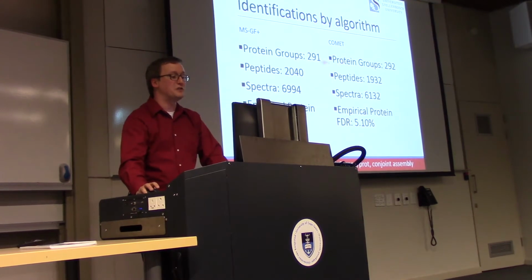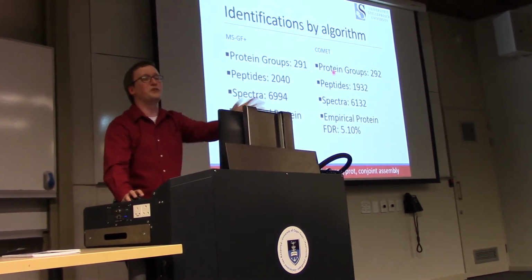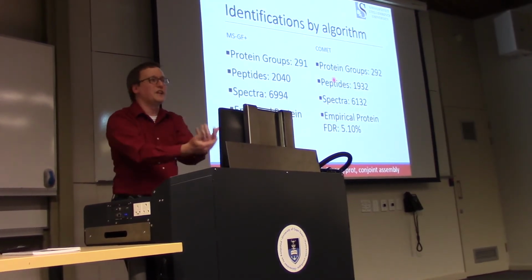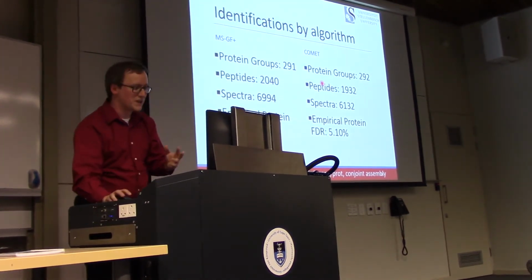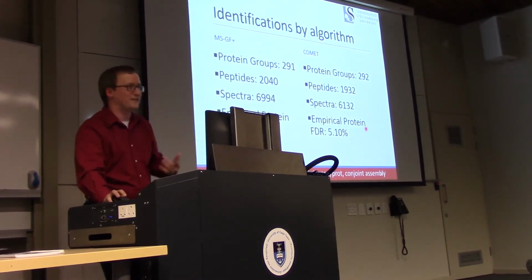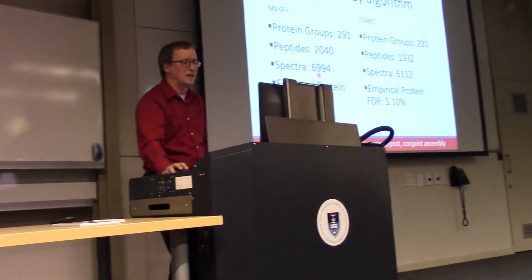First off, the number of proteins we get from biofluids is always poor, right? So don't hold this against the instrument, certainly. If you're running urine, serum, or plasma into your instrument, the number of proteins you get is always going to be disappointing. So the number of peptides and spectra that we get is more relevant in this case. We had about 7,000 identifications by MS-GF+.